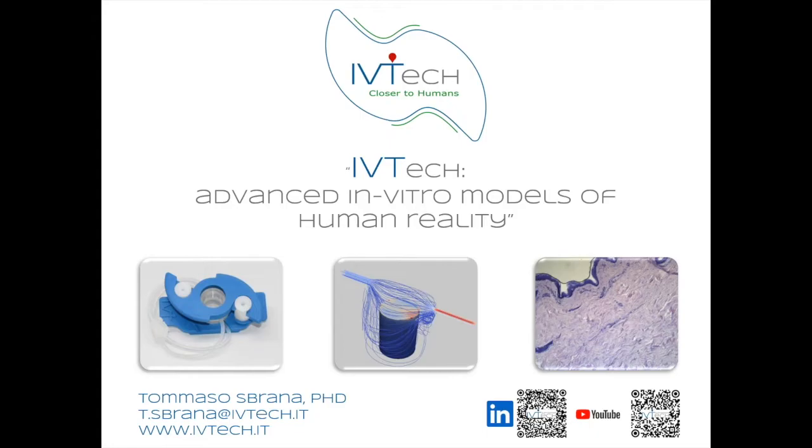Have you ever tried with 10, or has somebody else tried with 10 chambers? We have tried, from an engineering point of view, to interconnect 10 different chambers in series, and we obtained good results. But as I told you, once we have the biological material, we need to control and monitor each module. So having 10 different modules in connection, the complexity increased dramatically.